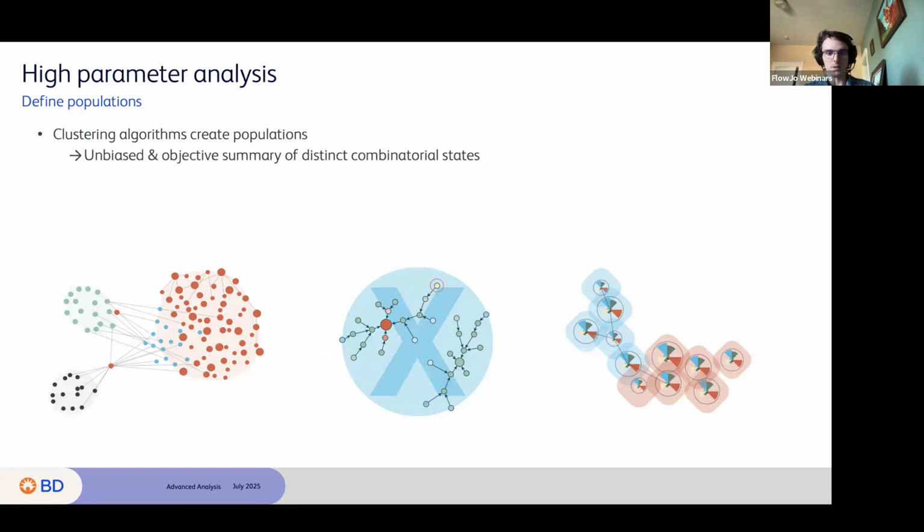These three photos represent three clustering tools available in FlowJo 10. We have Phenograph, X-shift, and FlowSOM. I should have mentioned at the top of this webinar that today we'll be covering basically everything in FlowJo 10. There is a new version available on our website, FlowJo version 11. The first release doesn't have all these algorithms incorporated into it yet. It just has X-shift available in FlowJo 11.